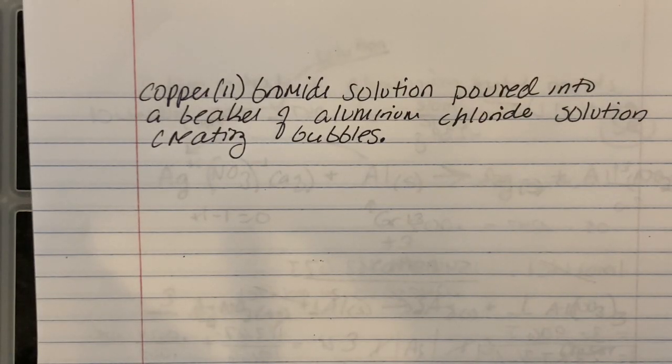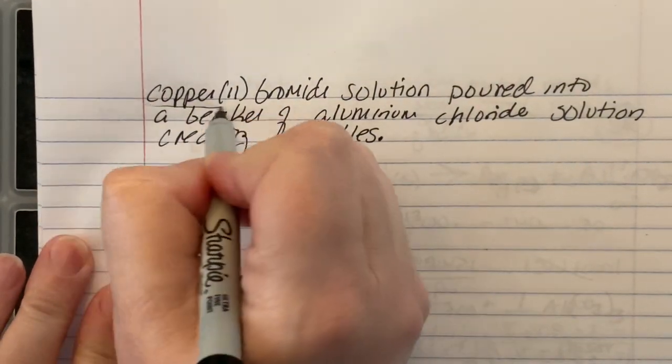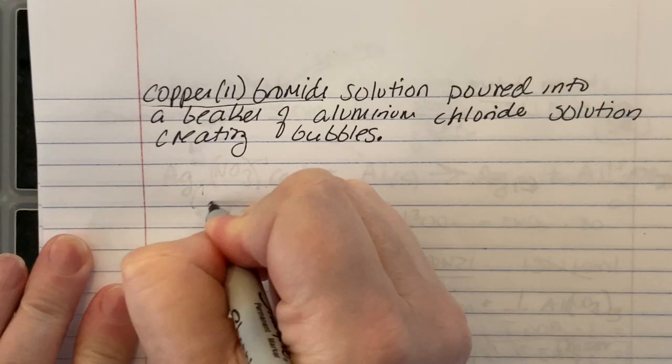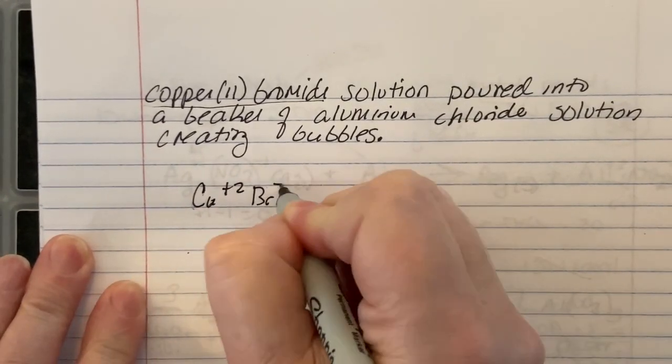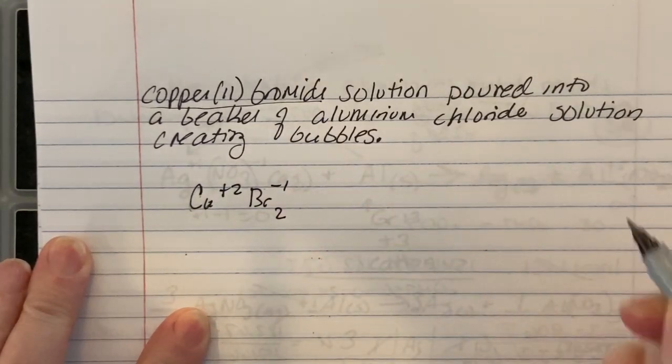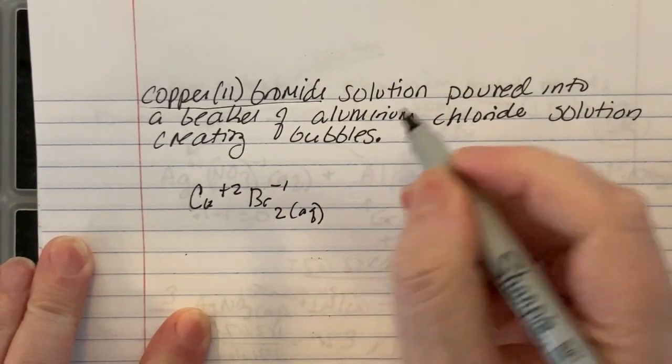All right, this time we are going to do a double replacement reaction where we have to predict the products. So it works the same as what we've been doing. We have to decode. It's copper 2 bromide, Cu plus 2, Br minus 1. Solution, aqueous. Pour it into a beaker.